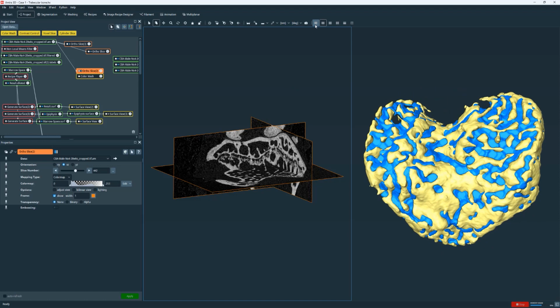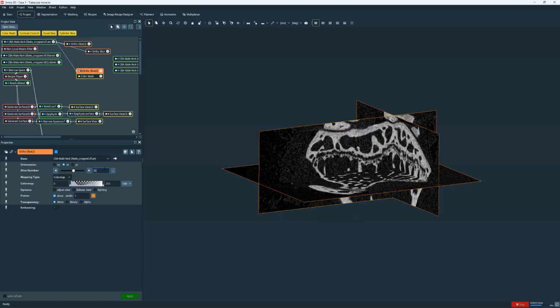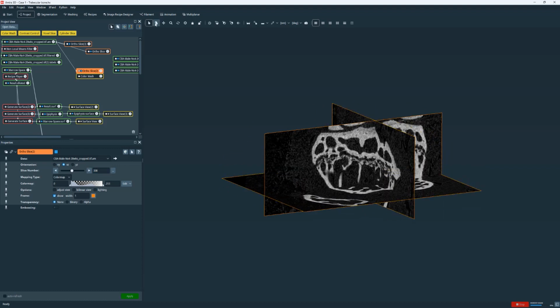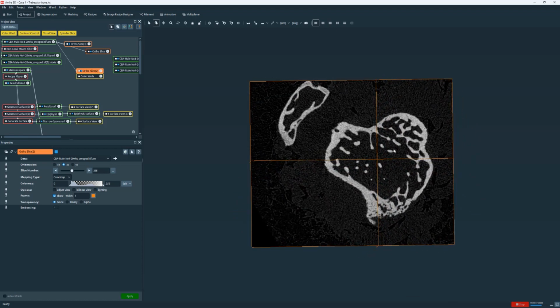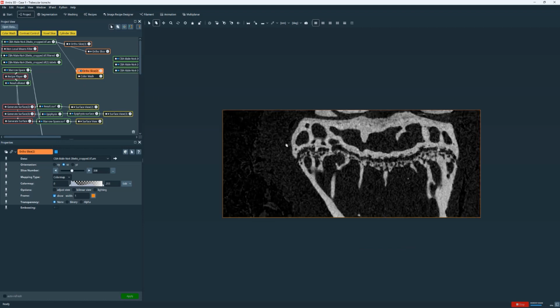So now I'm going to switch to a single viewer, where basically we can move the slices with the mouse like this, or we can also set up a specific ortho slice using the slice number. Moving, so basically the ortho slice allows you to observe the dataset in different cross sections. So now I'm going to switch off two ortho slices and keep just one. And then again, the top structure corresponds to the epiphysis, and the bottom side of the structure is the metaphysis basically. So we are going to focus on the segmentation of the epiphysis.